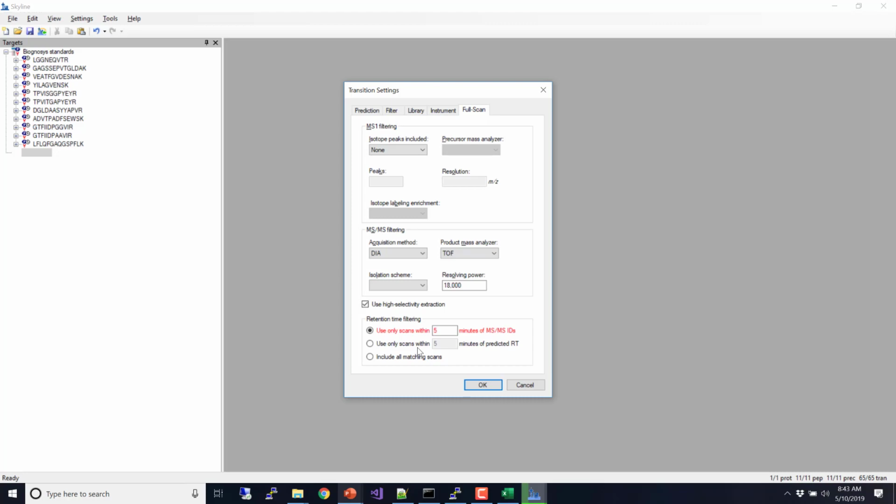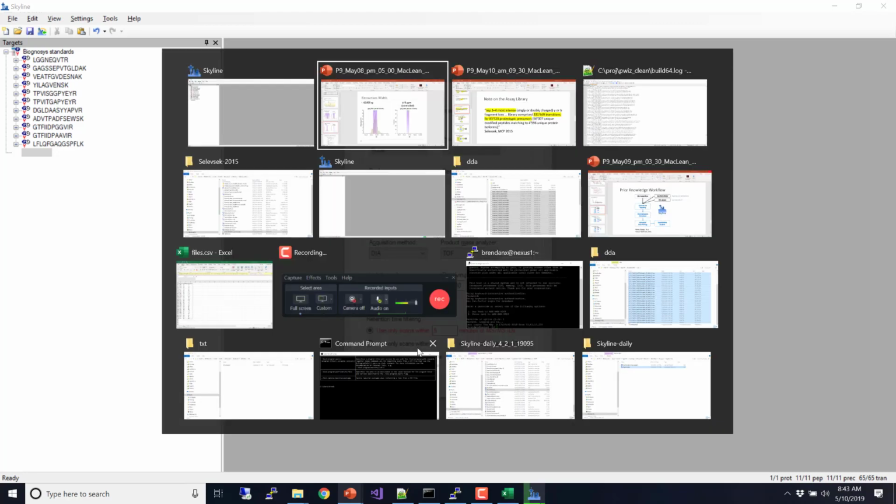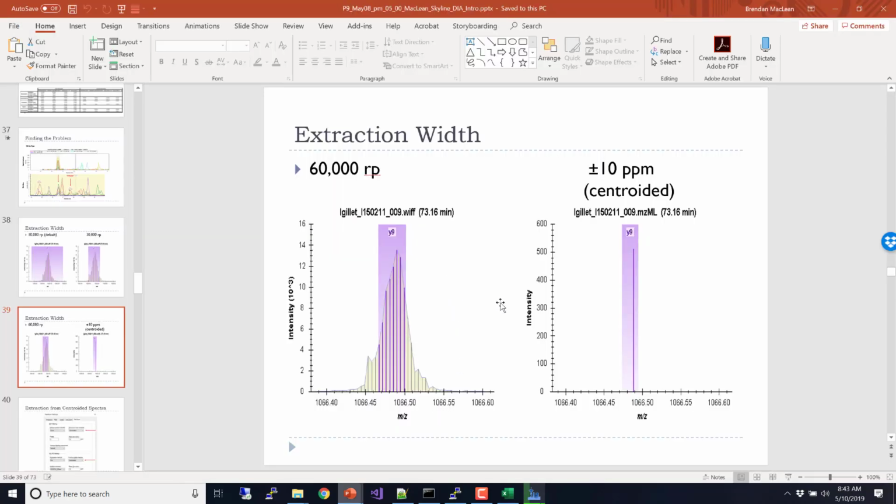No, actually, we had that problem with SciX until recently, and they helped us change it. But you get fairly similar values. This is the SciX data, and you can see the values change radically from 500 to, if you think about this is 14,000, and then summed would be quite a different number. They have since worked with us to try to get the numbers to match better.